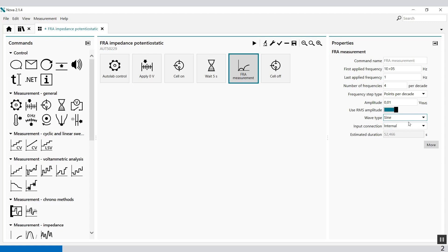So these are the settings. But there are some additional properties. Unlike other measurement commands which have common additional properties, the FRA measurement command has specific additional properties which can be accessed by the More button. So click More.